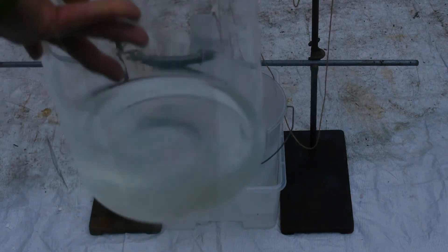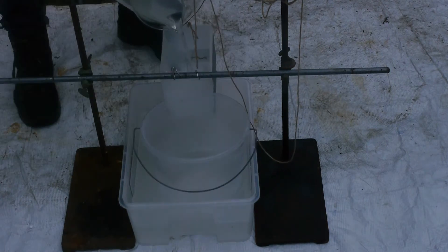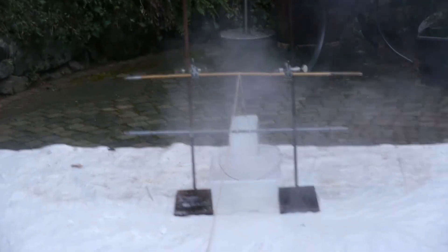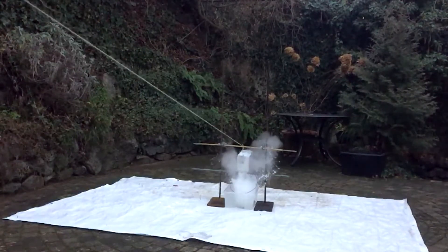This time I have dissolved the 666 grams of sodium hydroxide in an equal amount of water, which resulted in a syrupy solution. Let's now pour in one kilogram of concentrated acetic acid. That was already a lot better — this smells really awful. I guess the water really helped to catalyze and speed up the reaction.